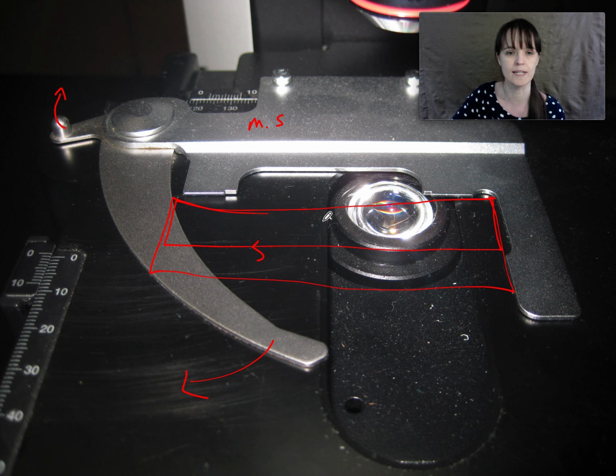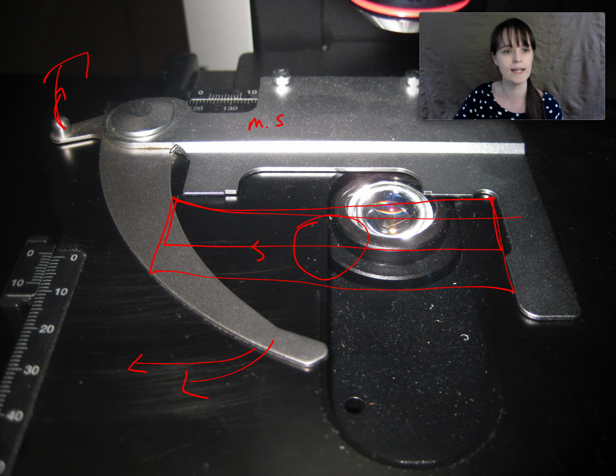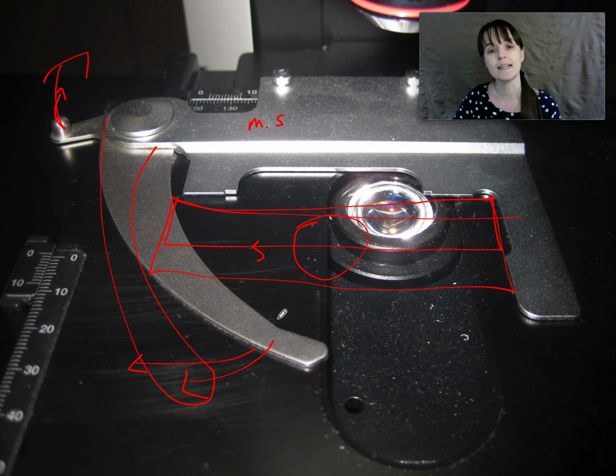It'd be like this. So you put the slide right here, and the specimen is usually right in the center. You have to, again, move the knob to move this out of the way, and then this is kind of spring-loaded, and so it holds the slide in place on the stage. The slide does need to be flat on the stage, not on the mechanical stage. It needs to be held in place by the mechanical stage.